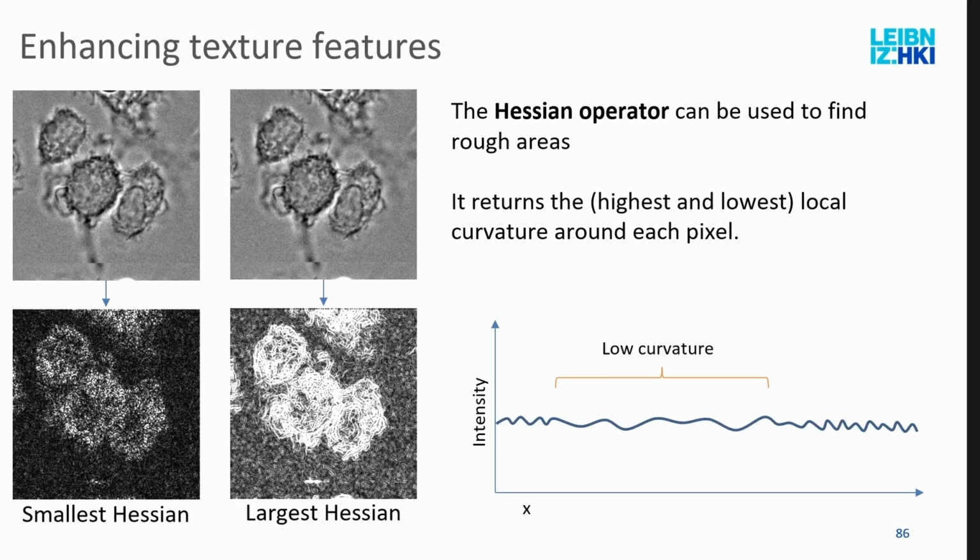And additionally, you know that when you do staining, this influences the results. There's a paper here from one of the groups, I think it's even Bachhave's group, where it was shown how much the staining actually influences the results. So if you have the option, you can go without staining.